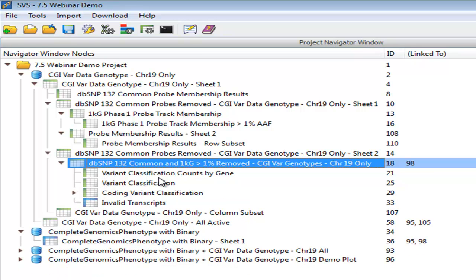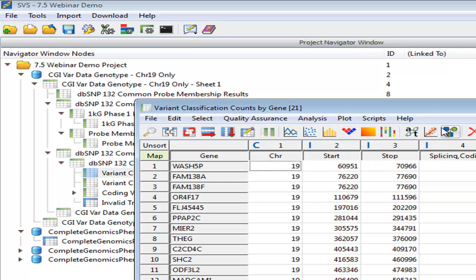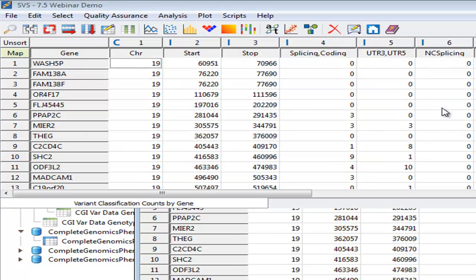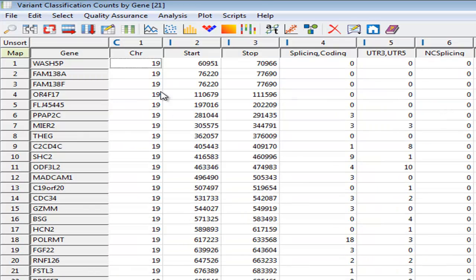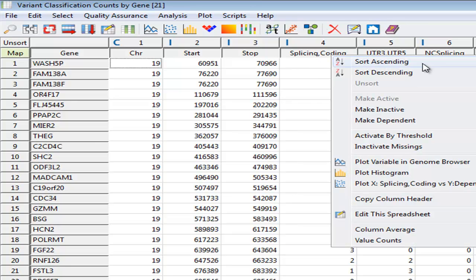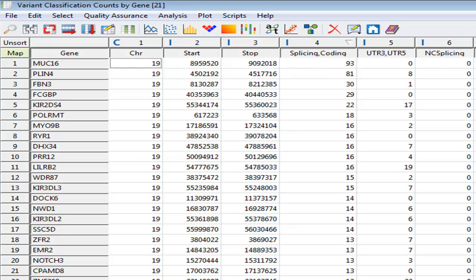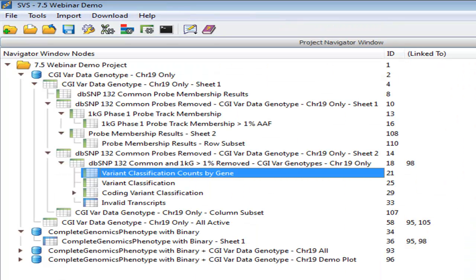You'll see the variant classification counts per gene. And as we open that, we'll see that this is a nice way to be able to quickly quantify if there are genes that have a large number of variants in different categories. So if we were to sort, which we can do on any column in our spreadsheets, on the splicing coding variant count, there's a gene here that has 93 variants that are present in our spreadsheet that are in a splicing or coding position of that gene. Let's go on to the next report from this analysis.